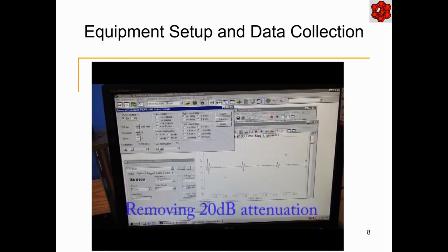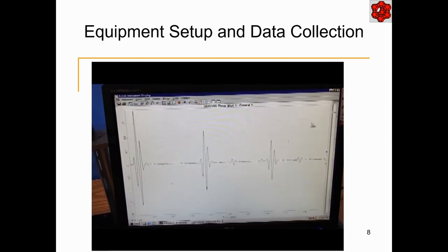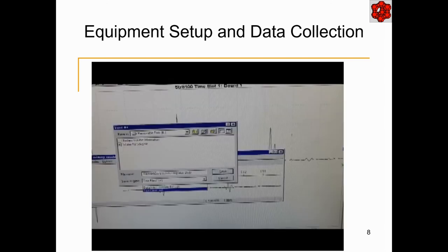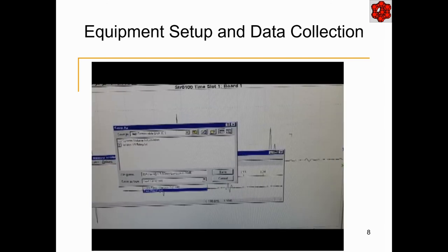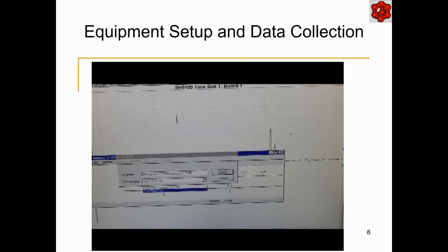If the sample is very attenuative or thick, it may require adding gain or reducing attenuation. We record any added gain required. The signal amplitude with the sample present might typically be adjusted if the signal with the sample drops to less than about 20% of the screen height. I find it convenient to make the changes in multiples of 6 dB or 20 dB because these added gains will be converted to a scaling factor in the MAPIS software.